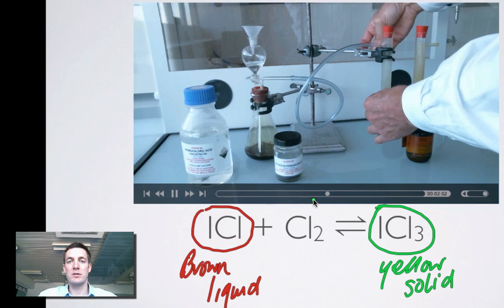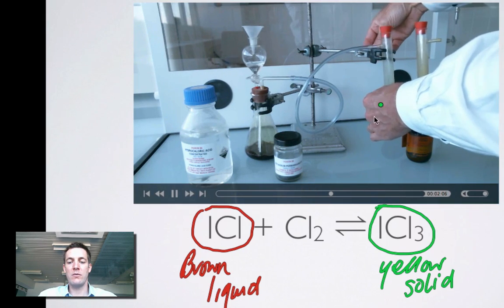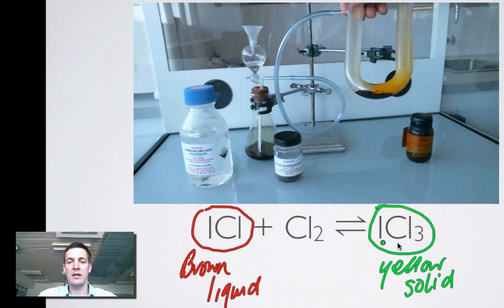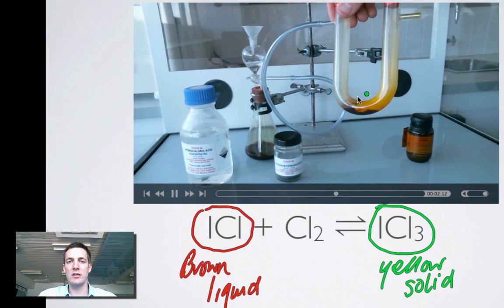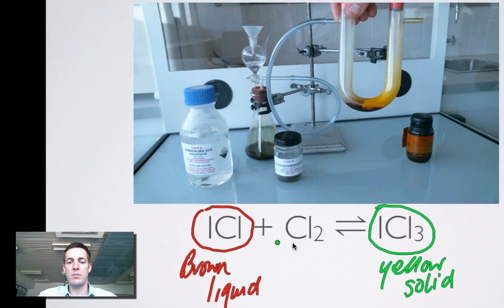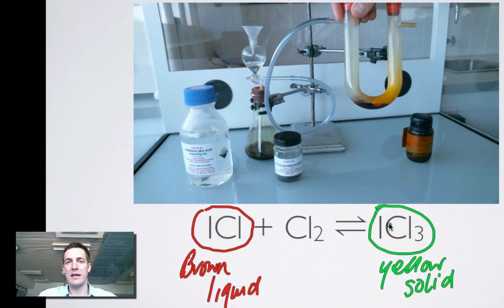So we're adding chlorine to this system. And what we should be able to see here as we do that as the chlorine comes through is that we are starting to form again this yellow solid. So there you can see we've got brown liquid still but this yellow solid is starting to form again. So by adding chlorine, by adding a reactant, we're pushing the equilibrium over to the right hand side.